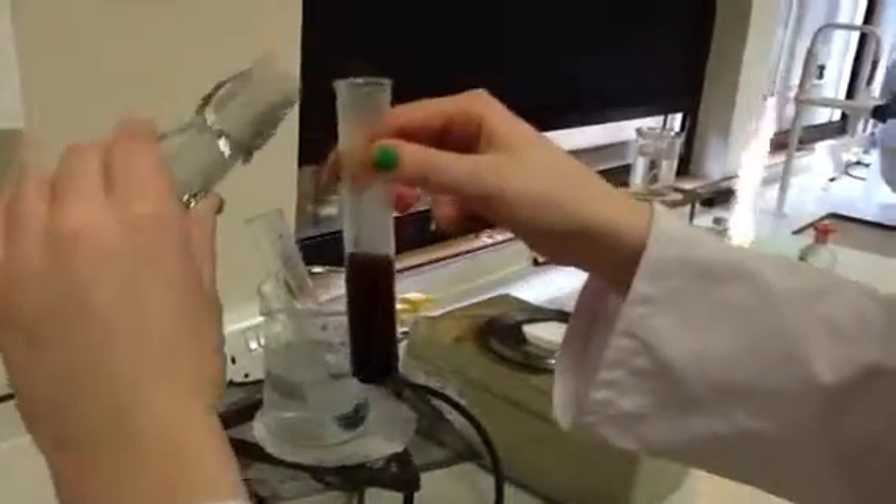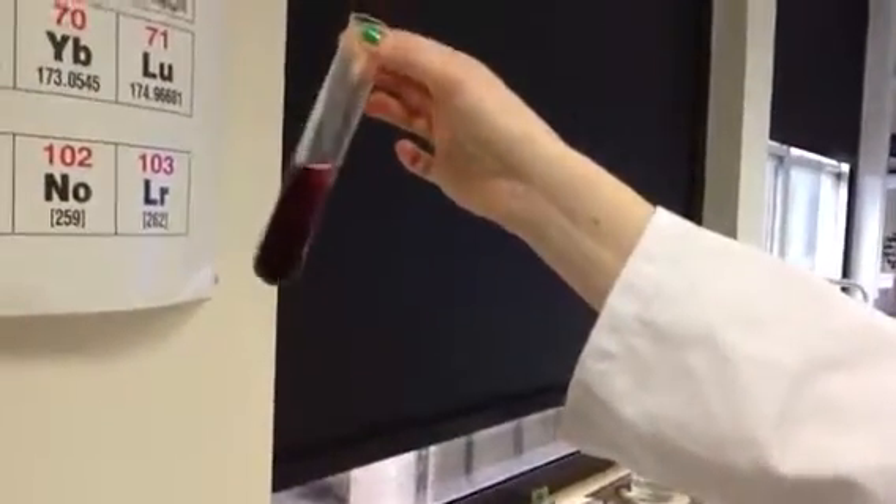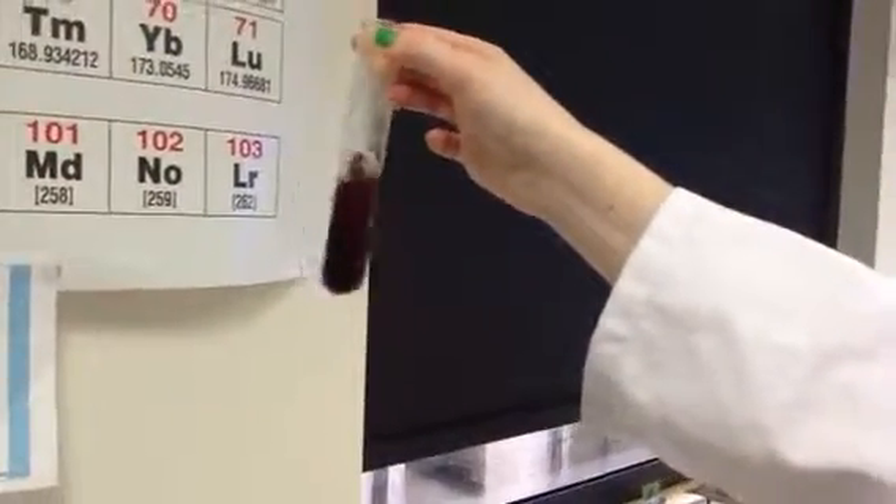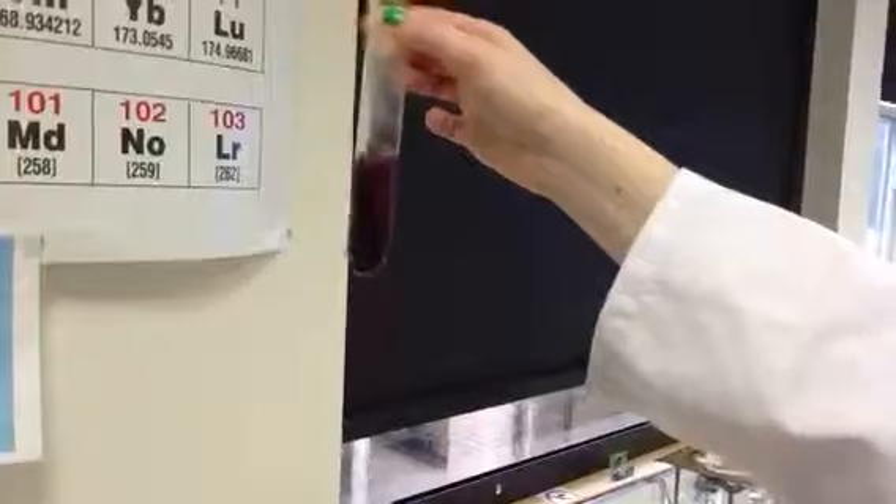Hold it up to the light so you can see how nice and red it is. You can see a lovely red colour against the white background, and that is the chromium 2 ethanoate.